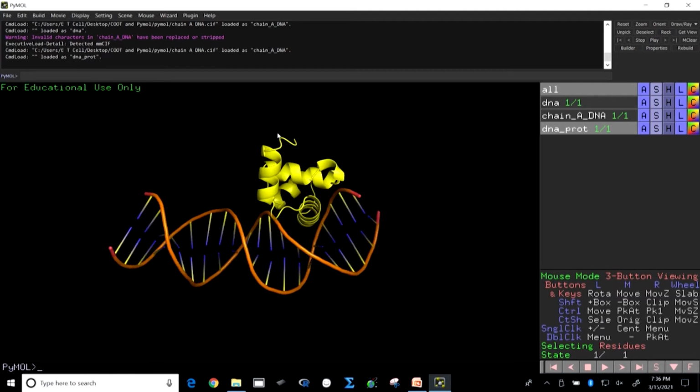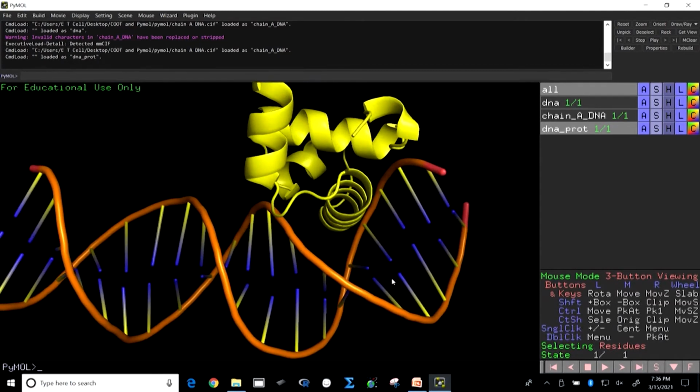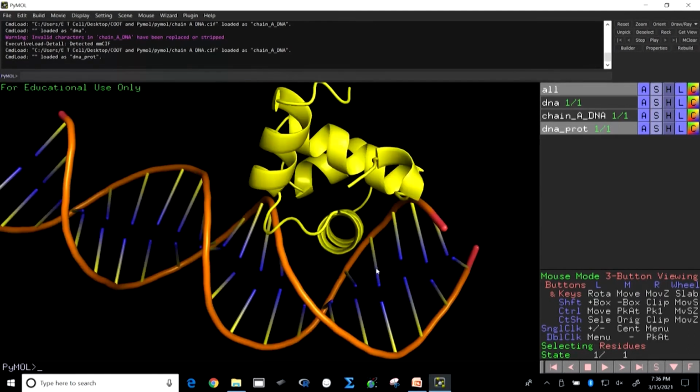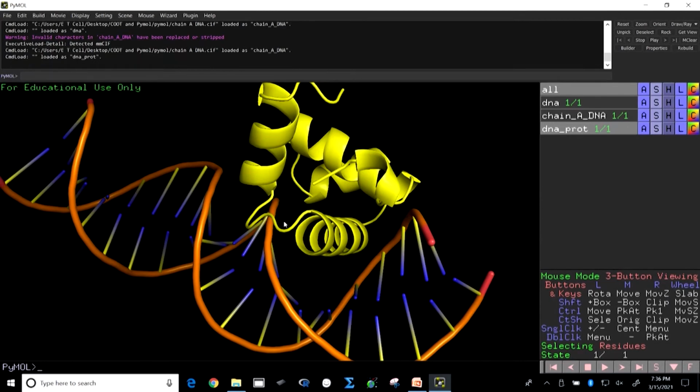If you see, certain part of the protein is still there, basically they form a dimer, I have picked out a monomer here. When you look at it, you will see that for a DNA there is a major groove and a minor groove. The interaction of a protein with the DNA happens mostly on the major groove, and as you see here, you will see the helix which is directly interacting in the major groove. There is a loop and there is helix.